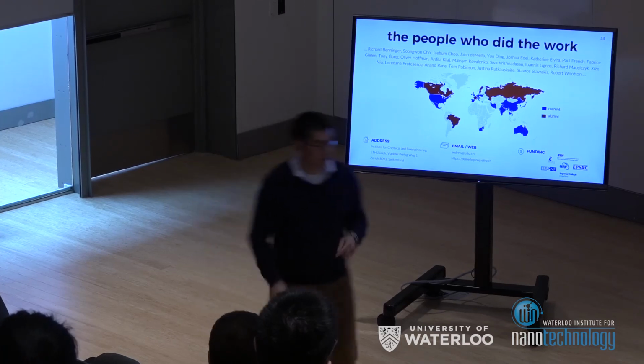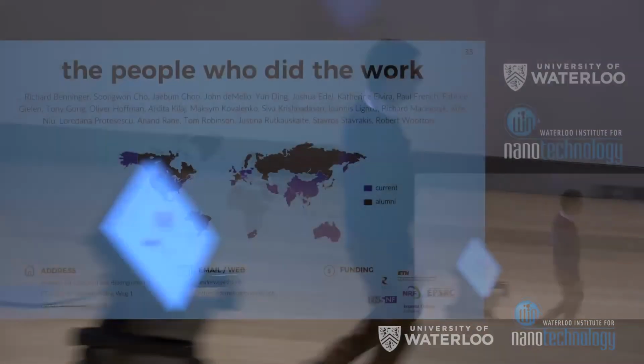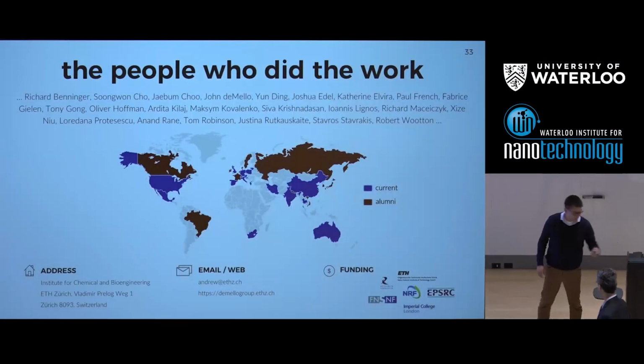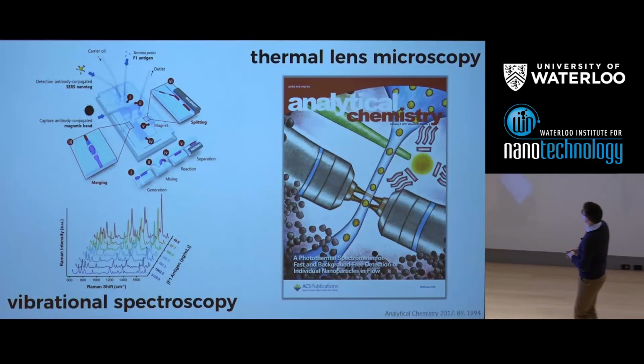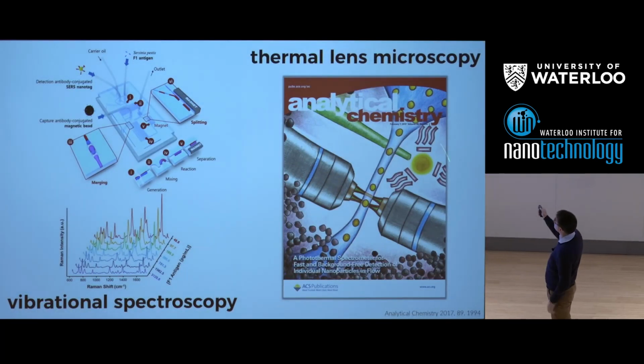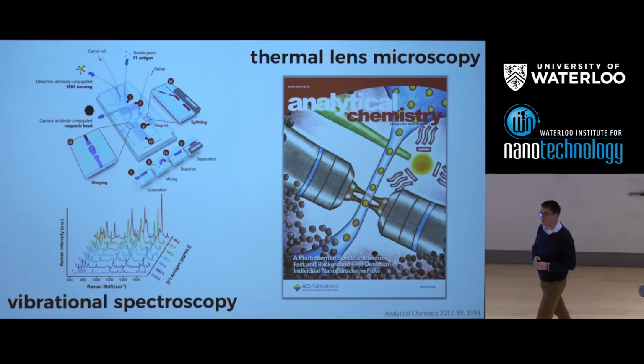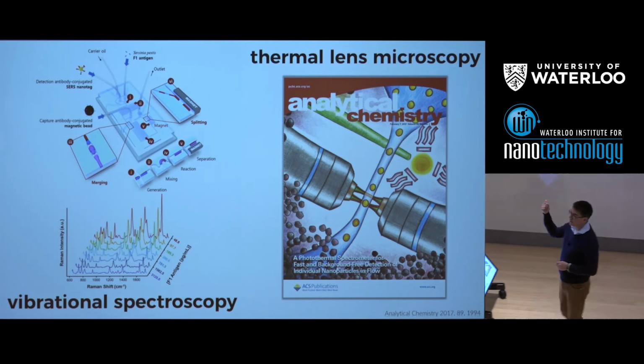In fact, just going back to that last slide, I know clearly we won't go through this now, but some of the issues related to limits of detection have really made us think about other techniques. And this is a method which we've worked with Kitamori's group at Tokyo to develop: photothermal spectroscopy.